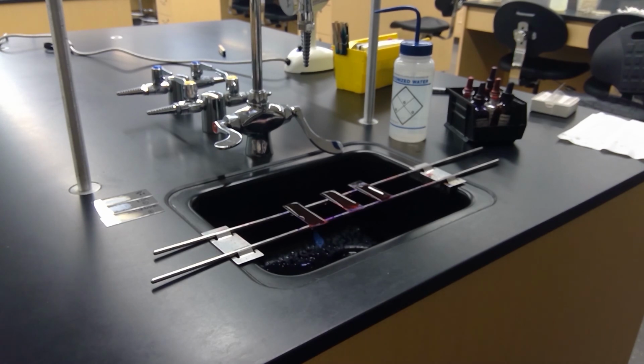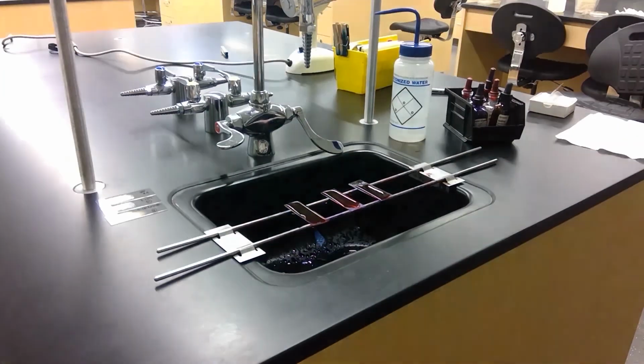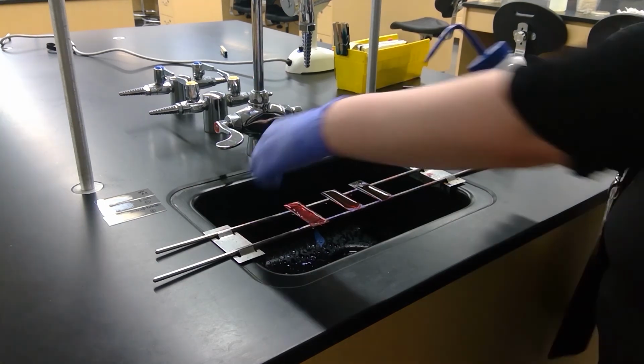Right, so now we'll wait 45 seconds. Alright, so now we are at step 12. Gently rinse the excess safranin from the slide with cold running water.